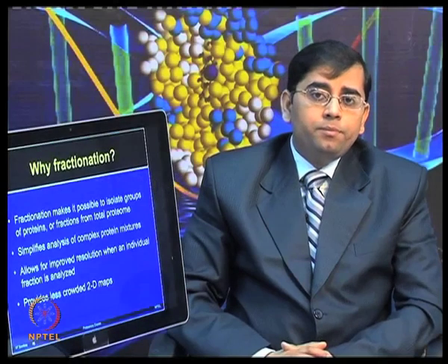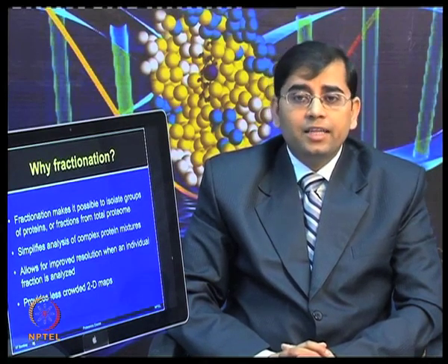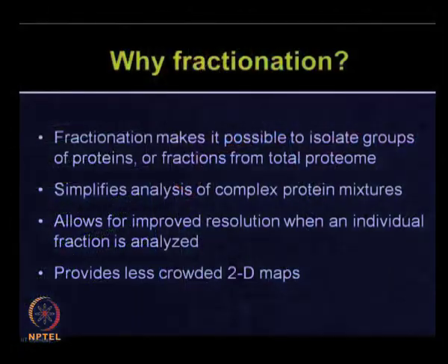So, why perform fractionation? Sample fractionation makes it possible to isolate groups of proteins or fractions from a given total proteome. By doing fractionation, you can simplify the analysis of a complex protein mixture. This method can also allow improved resolution of proteomic data, and when you obtain data from individual fractions and pool it together, it is going to be more informative.